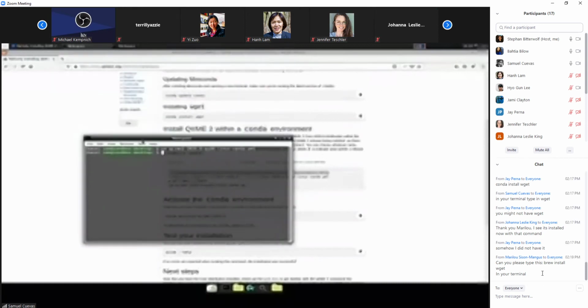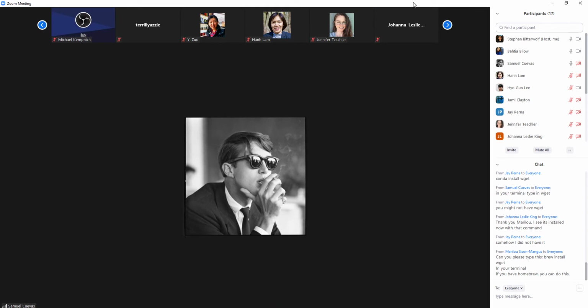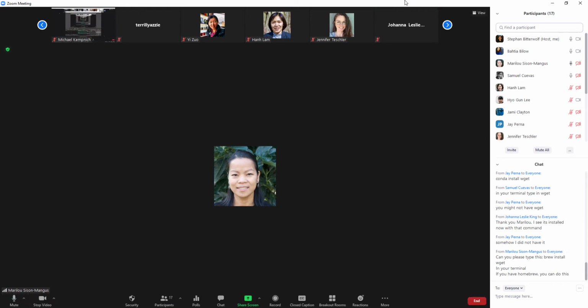Oh, okay. So why don't you maybe copy and paste the link to the site so that people can use it. Yeah, sure. And Mary Lou is saying to install wget, you type in brew install wget in your terminal, if you have homebrew. Yeah, this is the one that I was stuck with a while ago because wget doesn't work on my Mac.